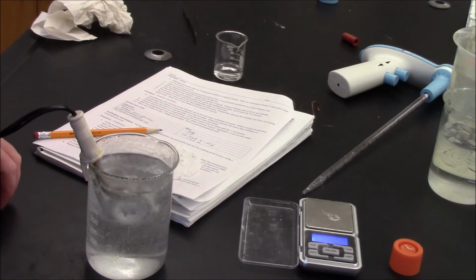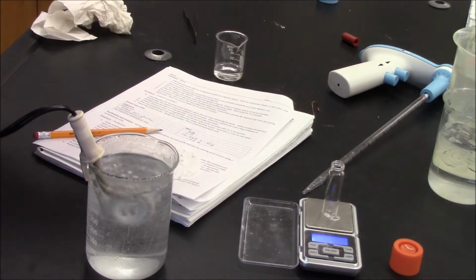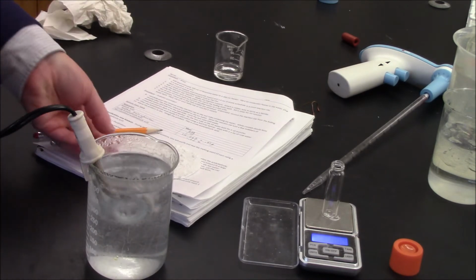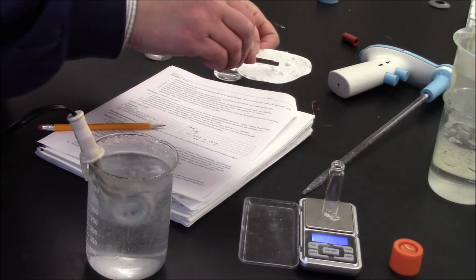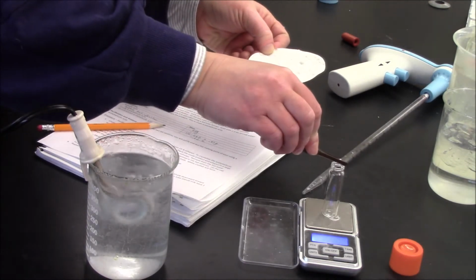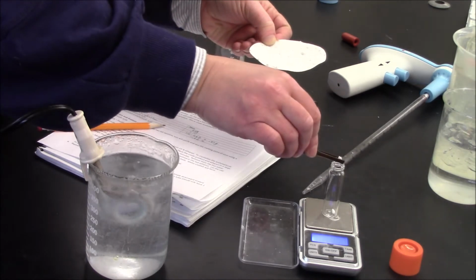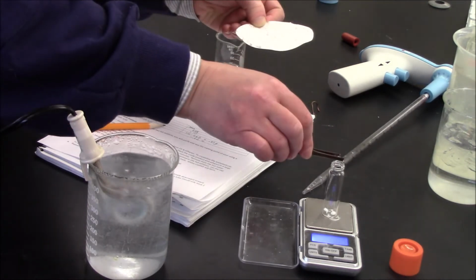Next, what I need to do is begin my recrystallization process. I've made my 25% ethanol. I have my large reaction vial, and I've determined its mass. Now to my large reaction vial, what I'll be adding is as much of my crude product as possible. I need to determine the mass of the product that I'm adding simply because I need to determine the amount of 25% ethanol that I'm going to recrystallize it in.